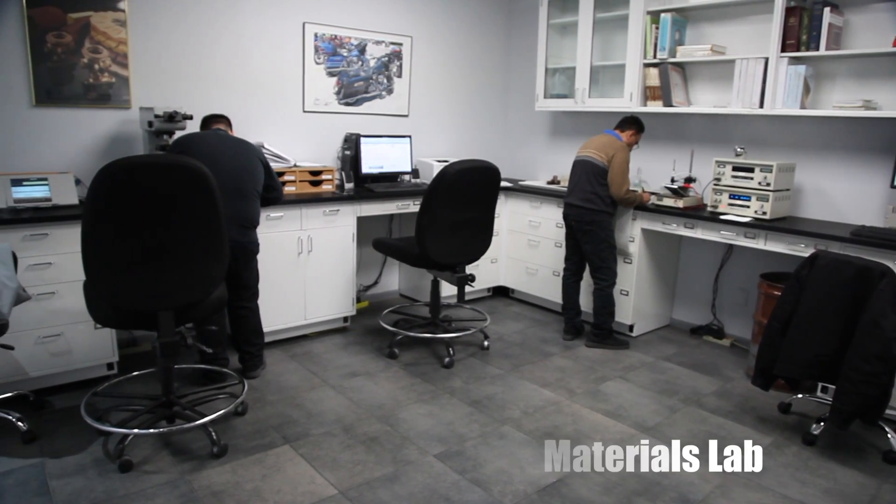Let's go talk to Deshaun in the materials lab now. Hi, I'm Deshaun. I'm the director of quality at Arlington Plating. And what you're seeing is our reliability testing lab.